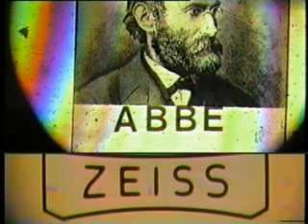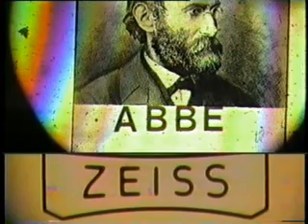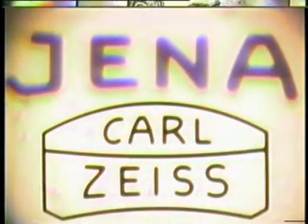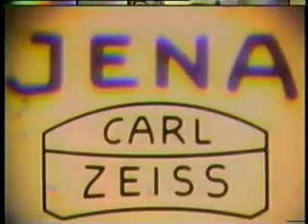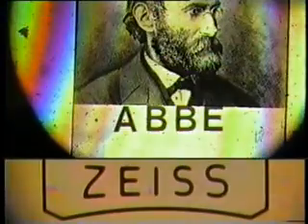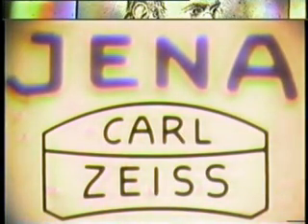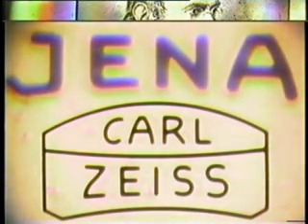What I have is a little mini picture of Abbe put into the back focal plane of the objective, and a small photograph of the Carl Zeiss emblem put on the stage. You'll see that these are both present in the microscope simultaneously, yet you're not seeing any of Abbe's whiskers mixed up with the Carl Zeiss emblem, nor can you see the shape of the lens that Carl Zeiss is written within superimposed on Abbe. This once again emphasizes the separateness of the two sets of conjugate planes.